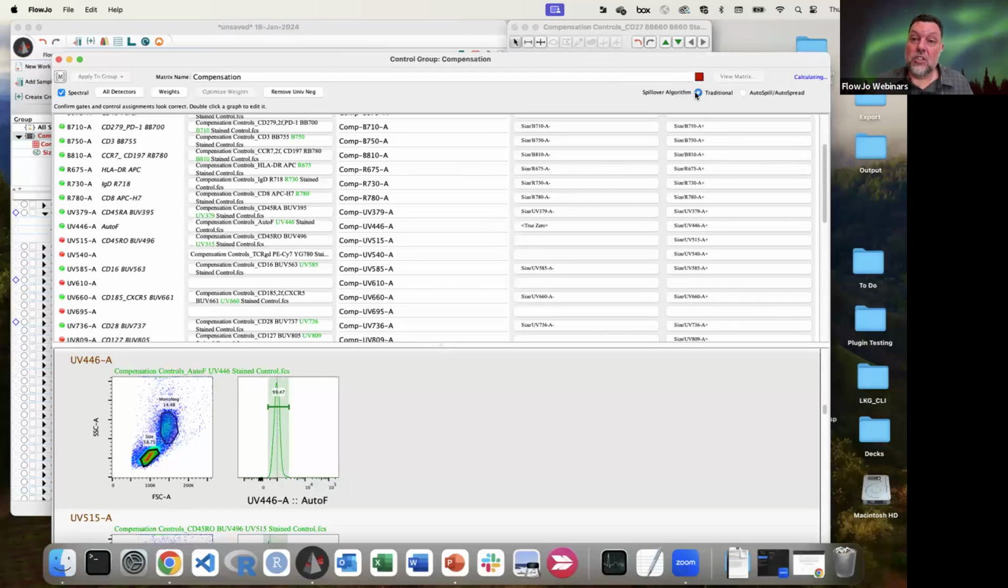But if you're doing traditional gated populations with autofluorescence subtraction, the purpose of this true negative is to give you a negative subset fraction and say we would assume that we want to compensate out all of the autofluorescence. So it's at 0.